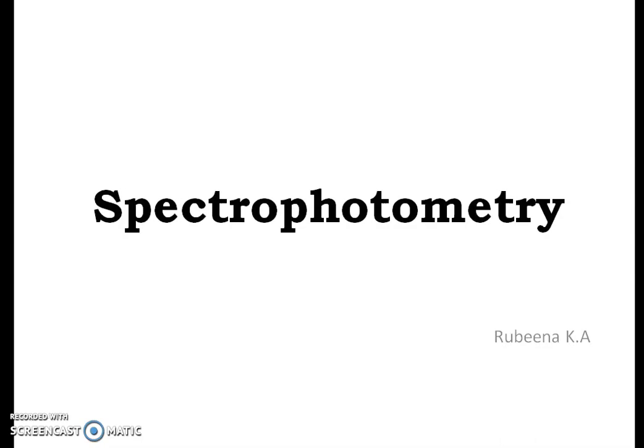Hello dears, now we will be learning about spectrophotometry.